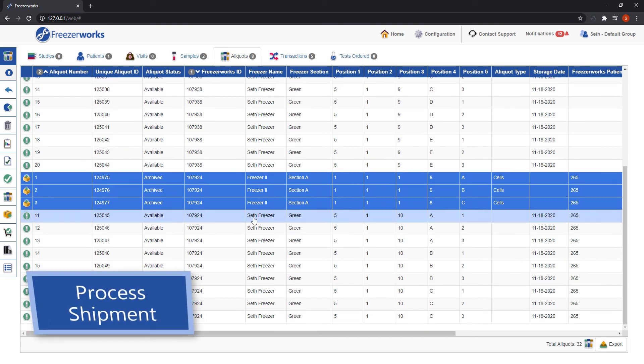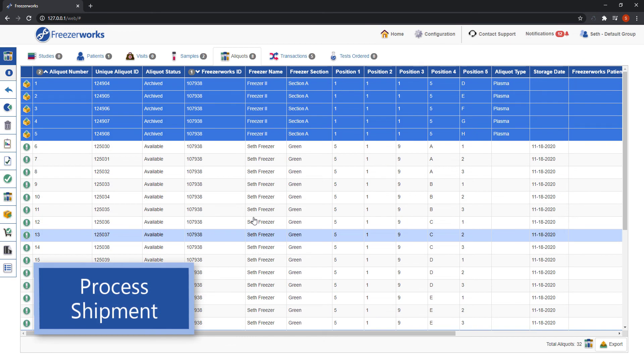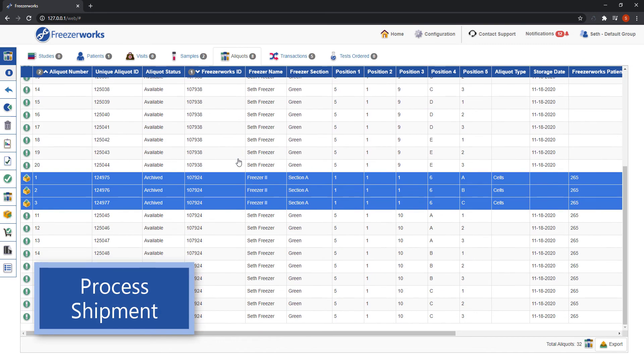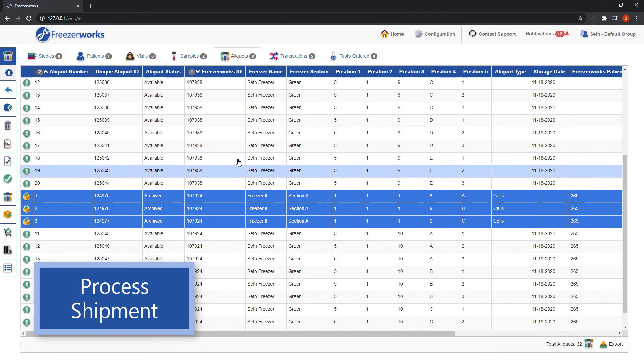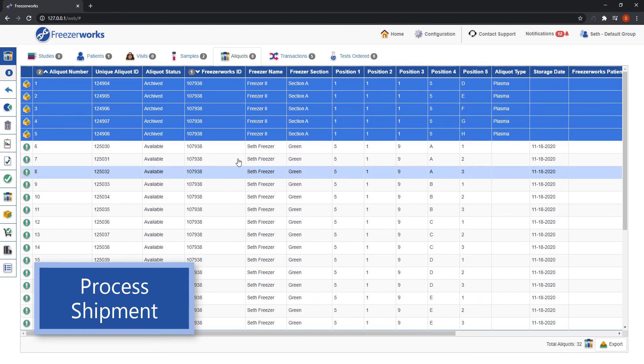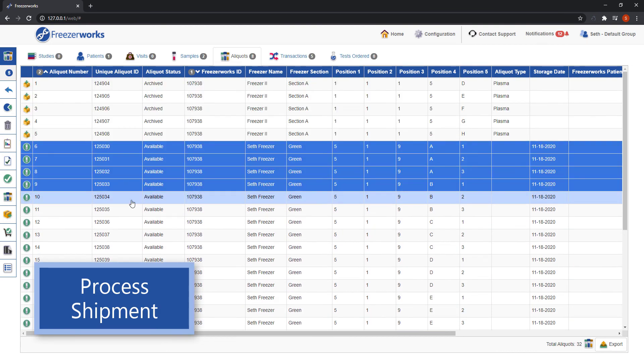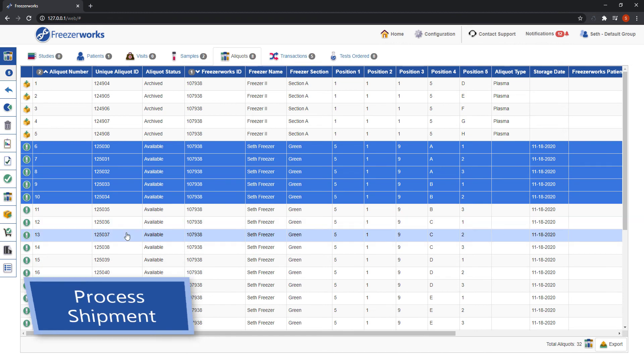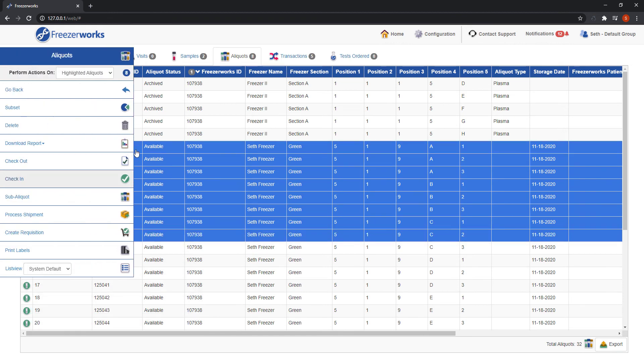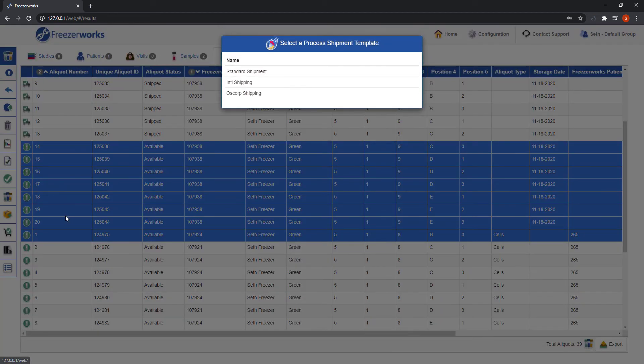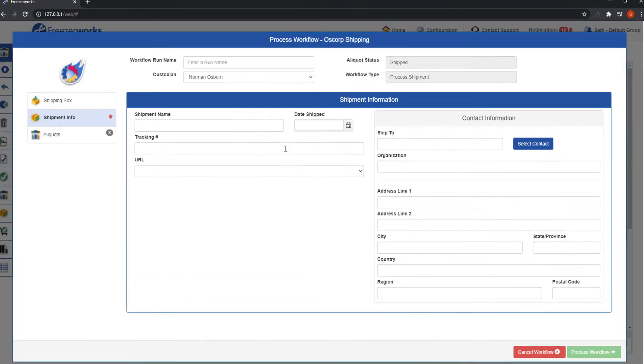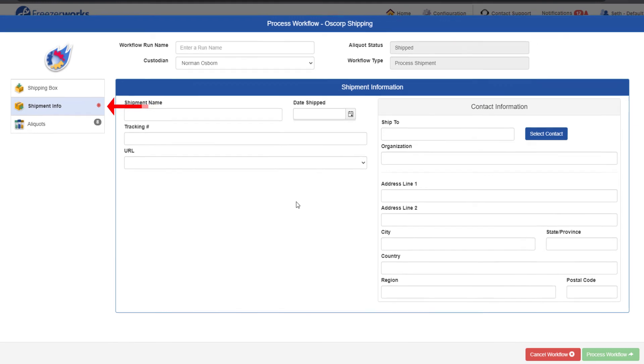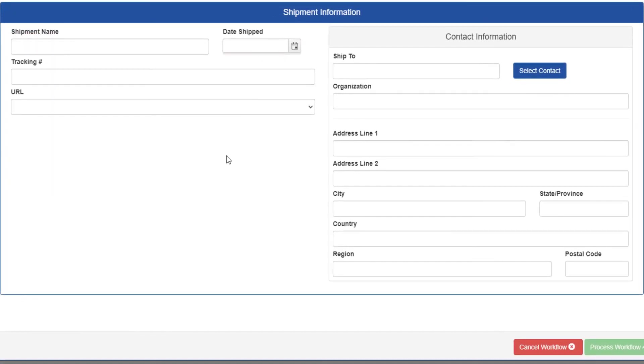The last workflow type we need to go over is process shipment. Let's say some of these new sub-aliquots need to be shipped off to another lab. We'll highlight them, hover over the actions menu, and select process shipment. Pick the template you'd like, and the process workflow form will appear. Everything about a shipment workflow is the same as a checkout, aside from a couple things. First, you will always have at least one required task page called shipment info. This is essentially the shipping file from the desktop.